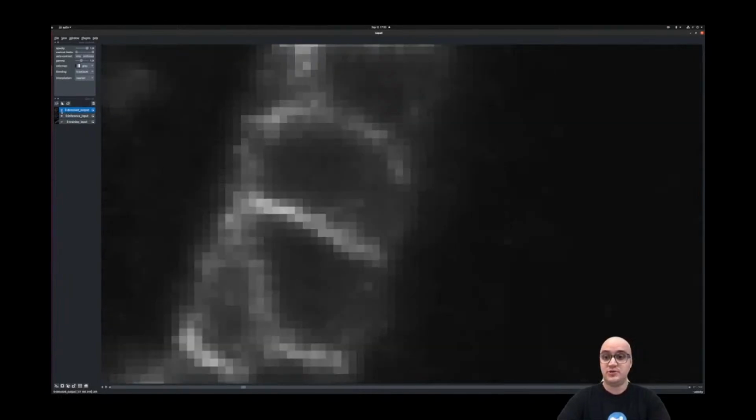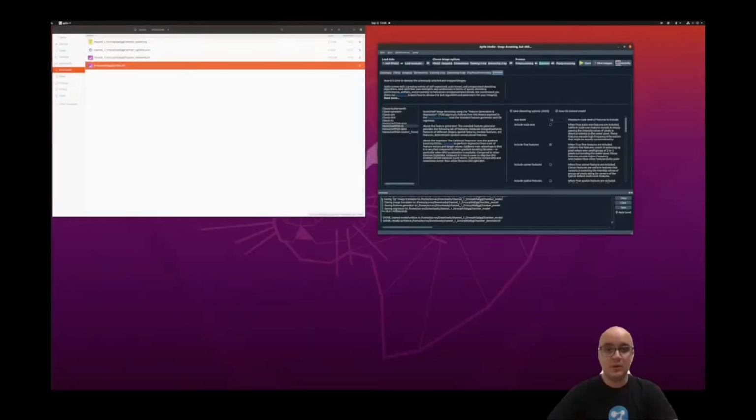With the help of hundreds of available plugins, one can also continue with downstream analysis of their images and compare how denoising helps their downstream analysis pipelines. Also, one can find the denoised image, together with all the configurations that were used to train the model and the trained model file, right next to the input file in the file system.